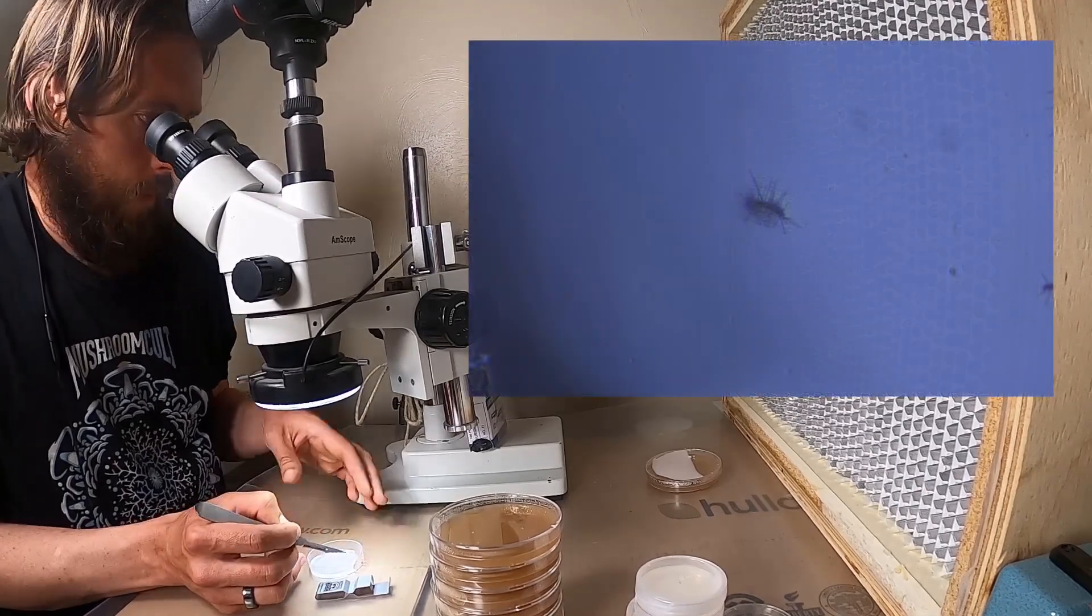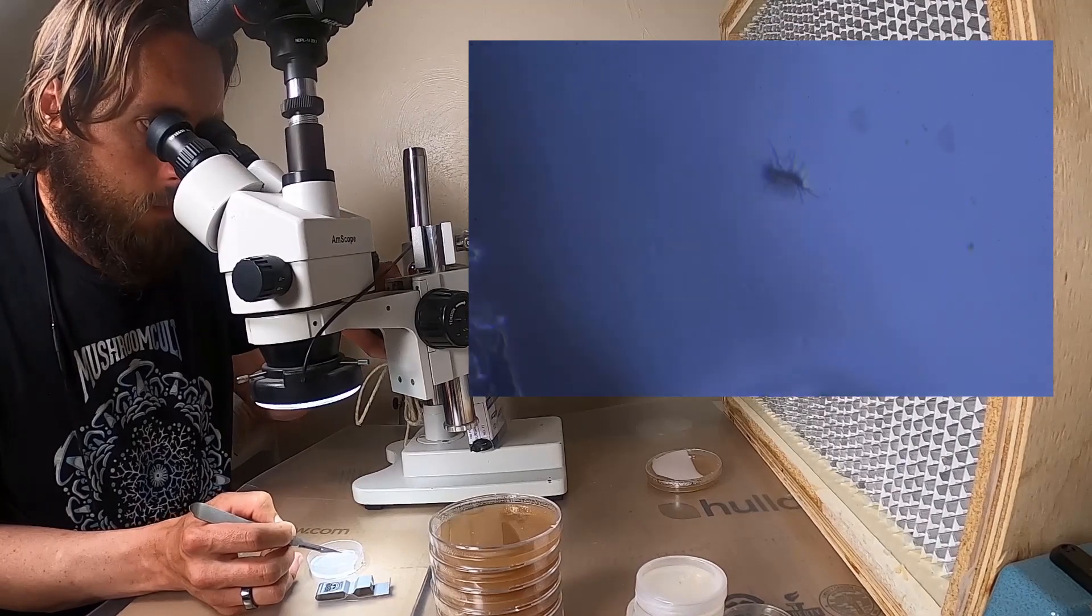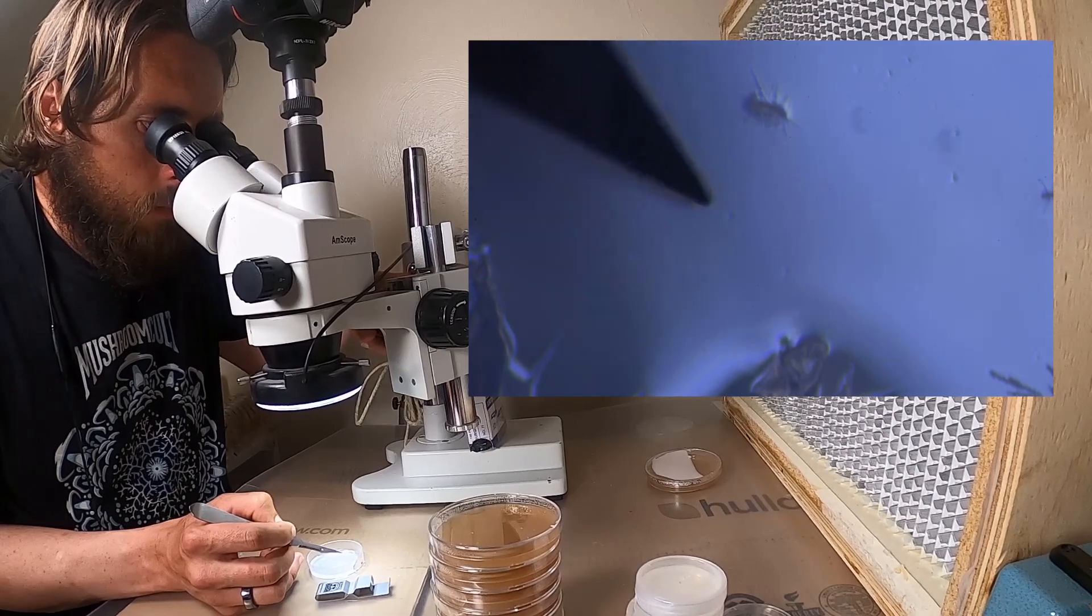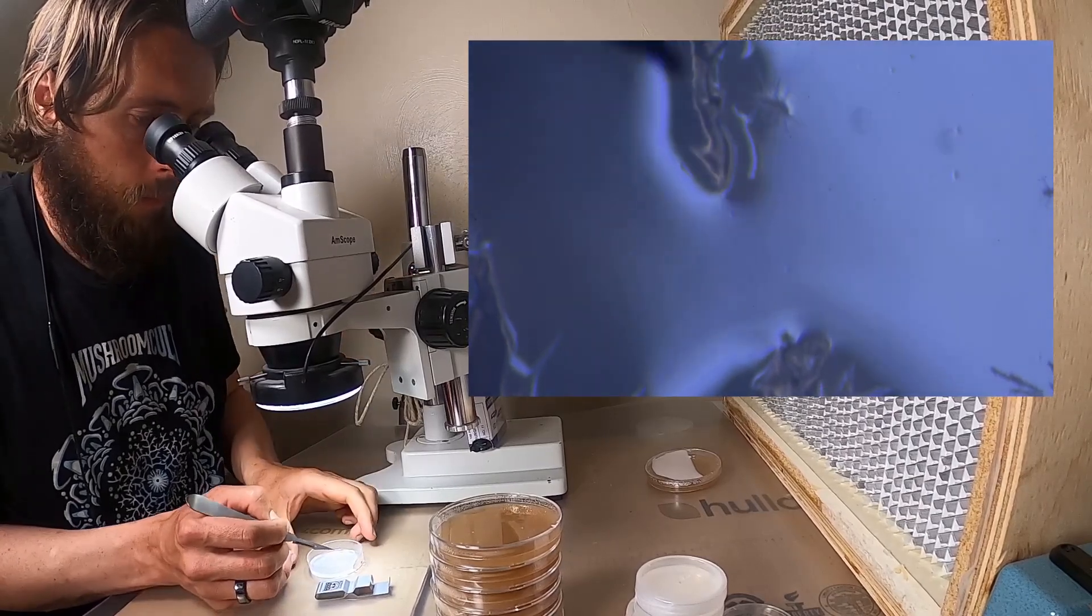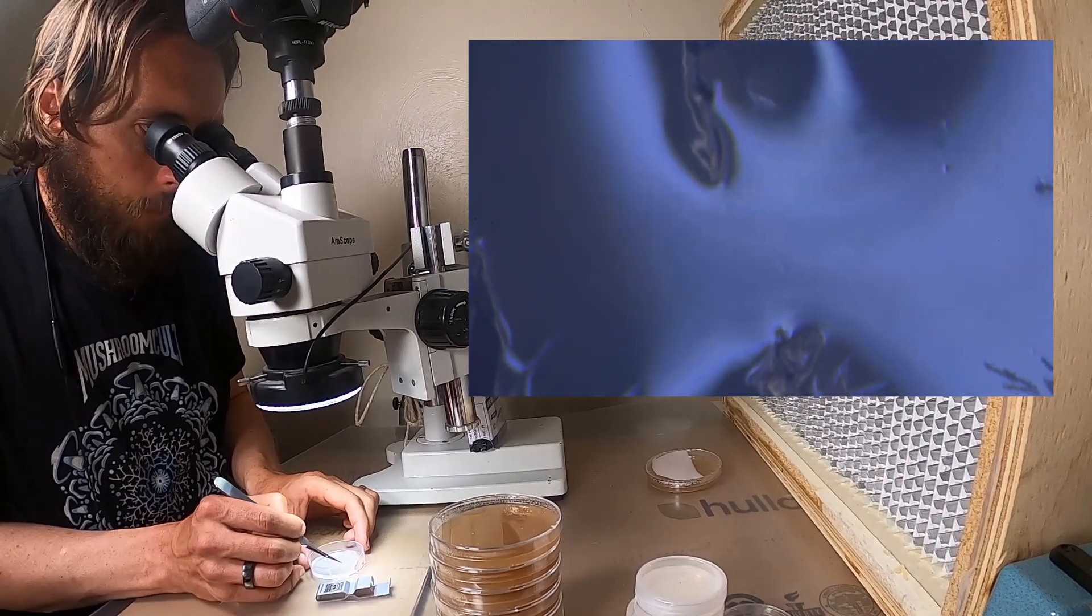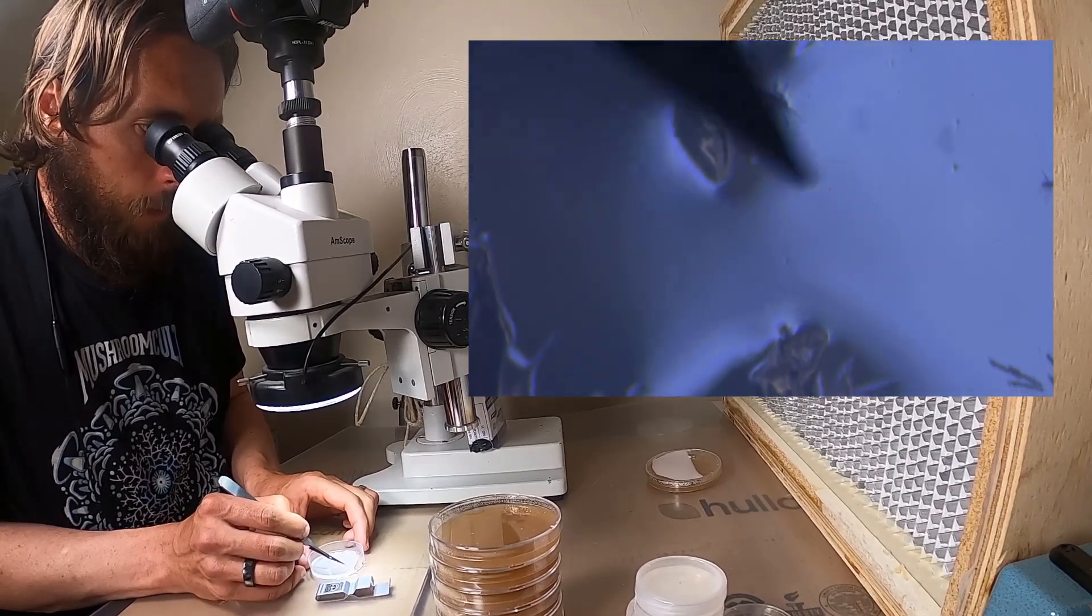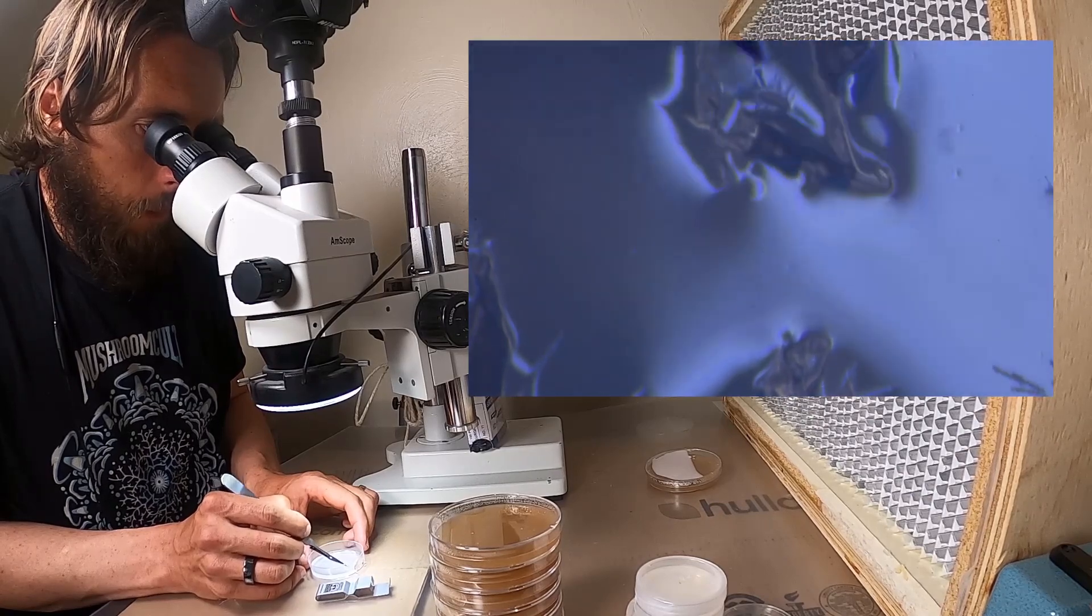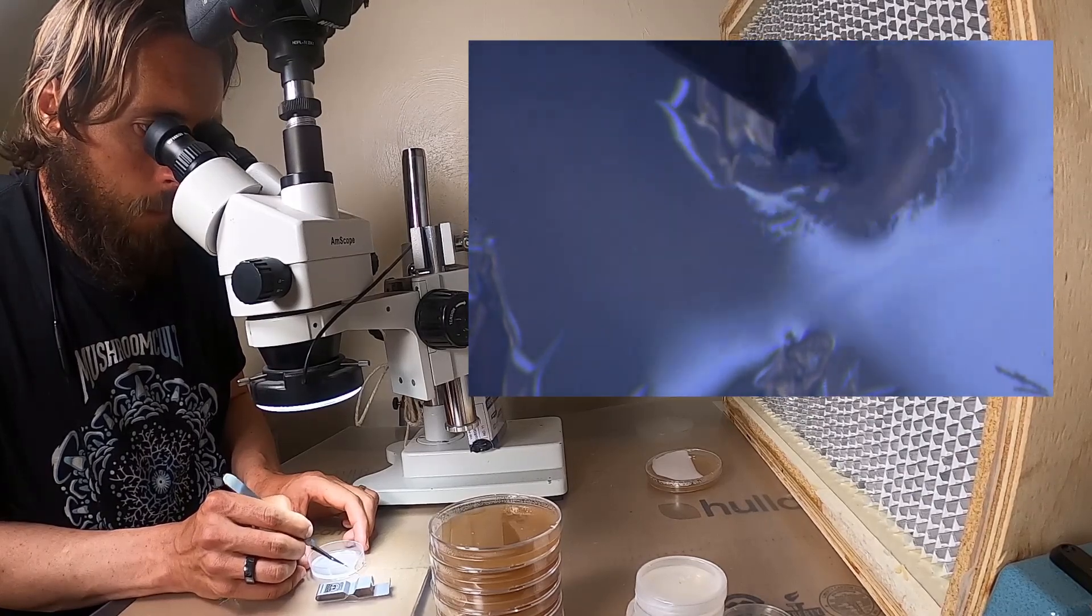Here you can see what the microscope can see. It looks like I found a single ascospore that has plenty of room because it's kind of difficult to navigate in such a small space. So I'm just trying to make a little square around it, try not to damage it, and then lift it out.